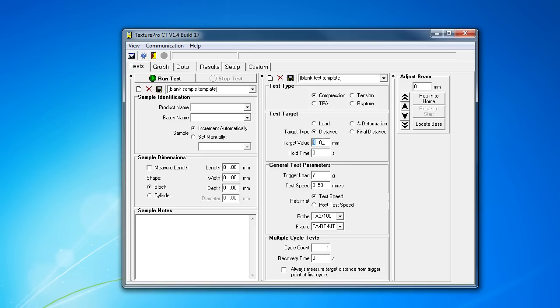I'm just going to set up a basic test here. I've got my little foam globe from the previous video, and I'm going to show you what it looks like on the user interface and the software side. From the original menu on the machine, there's really still only four basic types of tests you can do.